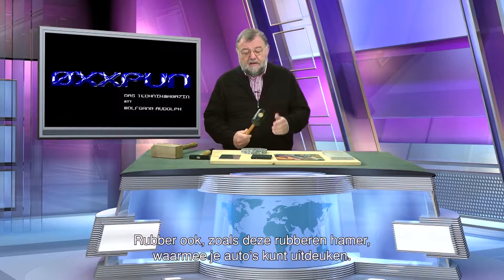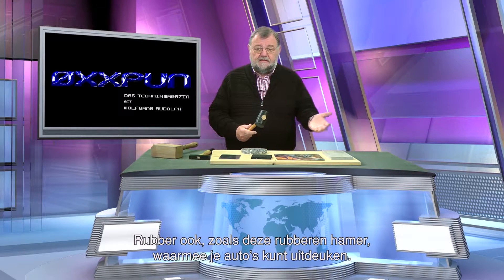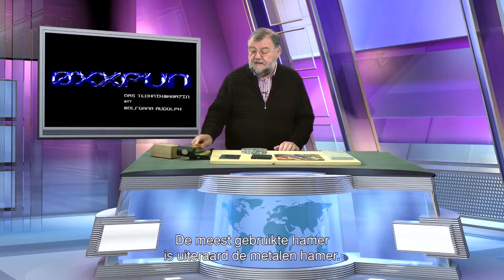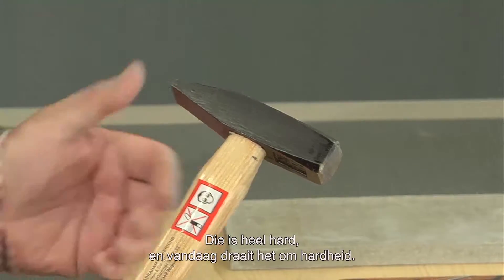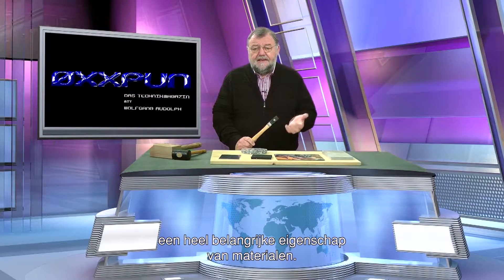Rubber as well, like this rubber hammer to beat out damage on cars — not really nowadays with plastic bodywork, but for metal it is perfect and for many other things. The most used hammer is naturally the metal hammer. And that's what it is all about. It is very hard. And hardness is a very important element, a very important characteristic of materials.